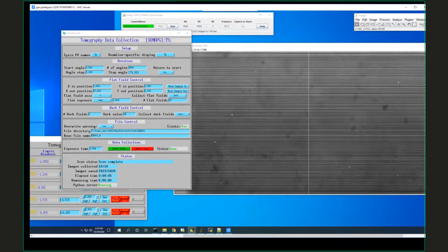Do you have any issues with the scintillator actually changing crystallographic properties as it's exposed to the harder or perhaps higher energy beams that are around this APS? This stuff, I mean, it seems to be really rad hard. You know, it's a single crystal. I've seen no problems with it.